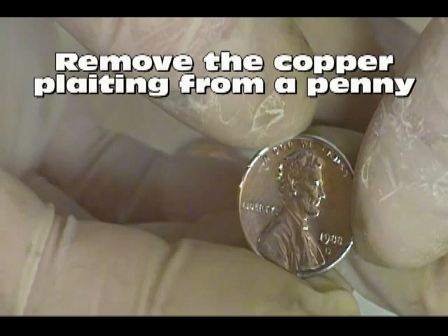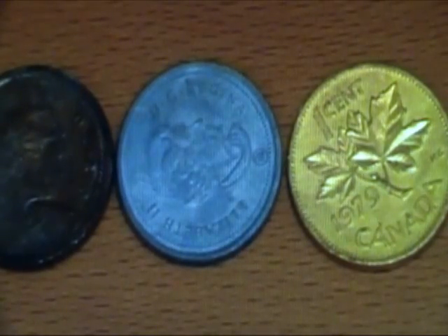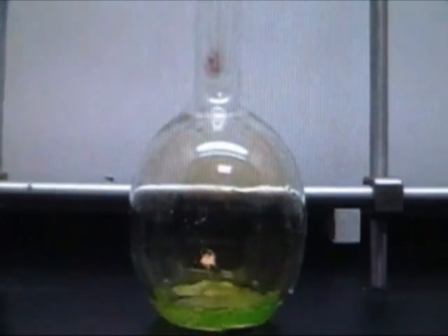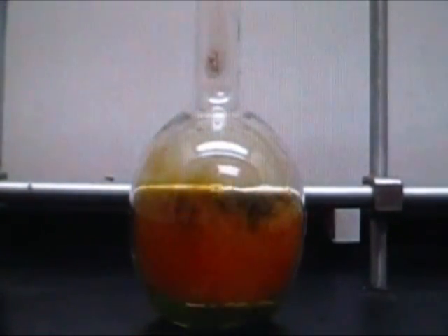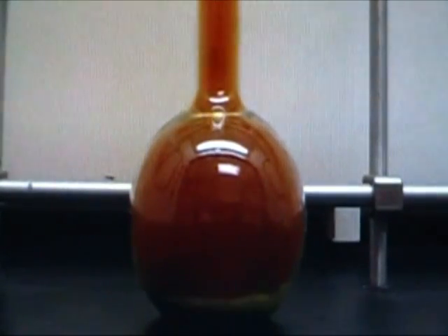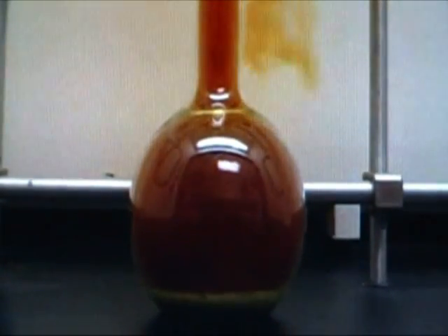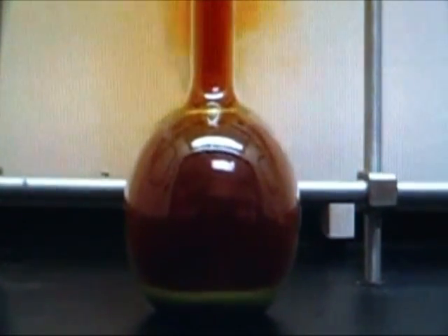Hey everyone, you can find a lot of neat penny chemistry on YouTube, including hollowing out a penny, zinc plating a penny, zinc plating then converting it to brass, reacting it with nitric acid, and so on and so forth. However, what I did not find is a video on removing the copper layer, leaving the zinc layer untouched. So in the name of completeness, I present to you a video on how to remove the copper layer of a penny.